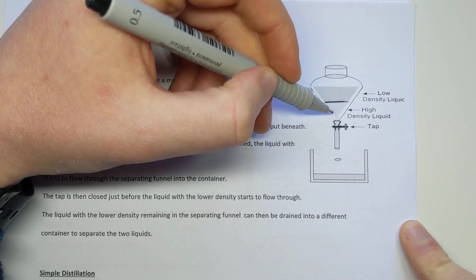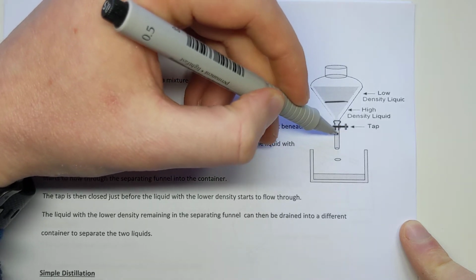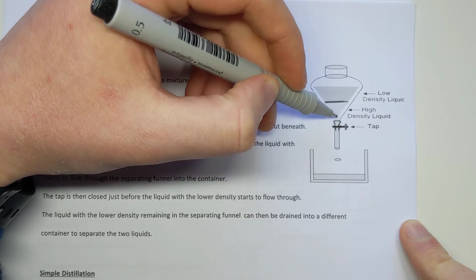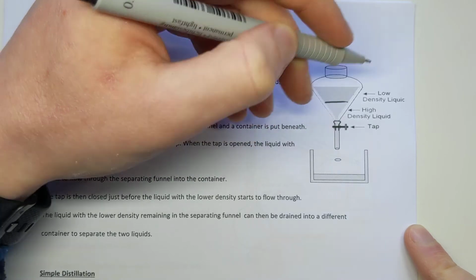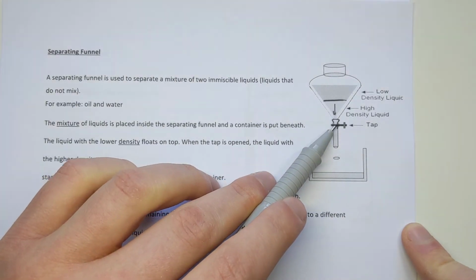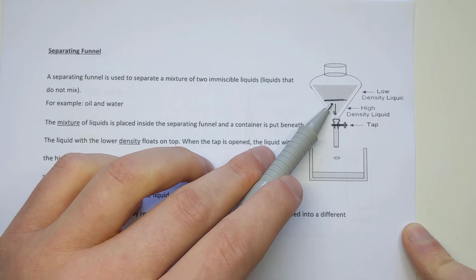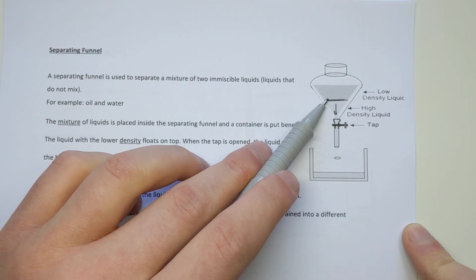The way we get these separated is that this funnel is attached with a tap. So when you open this tap, very slowly the liquid will drain out. Because it's drained out from the bottom, it's nice and controlled, nice and smooth. So I can gradually lower that liquid down into the beaker. The trick is, whenever I am emptying the liquid out of the tap, I want to close the tap just before it moves into the other liquid, because I want to get them nice and separate from each other.